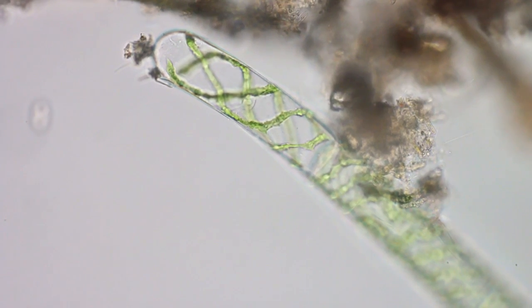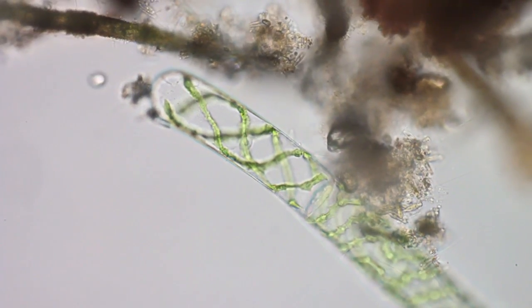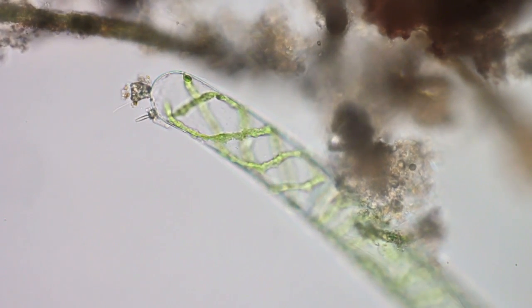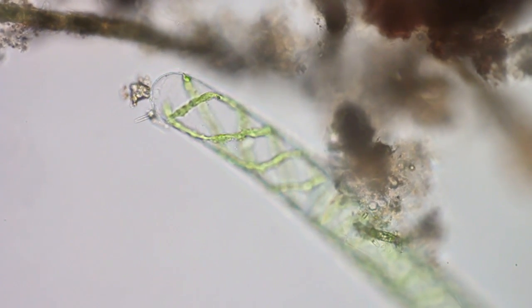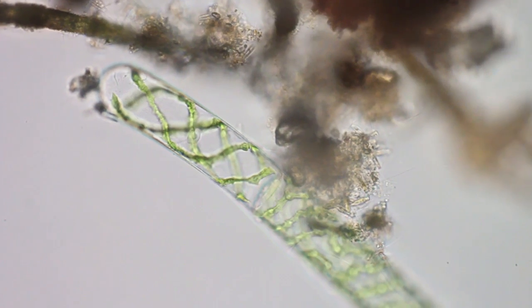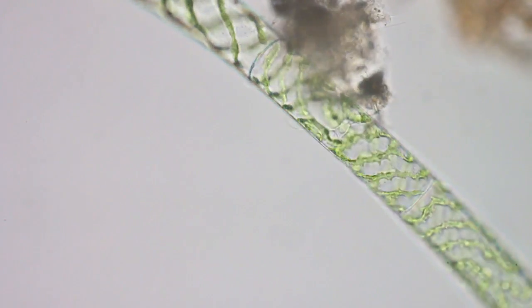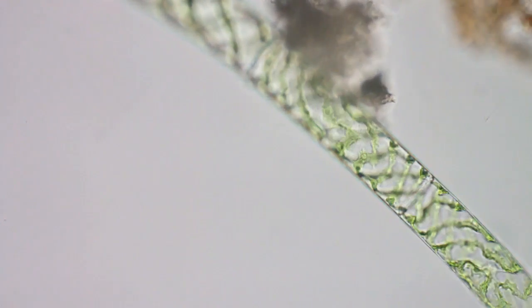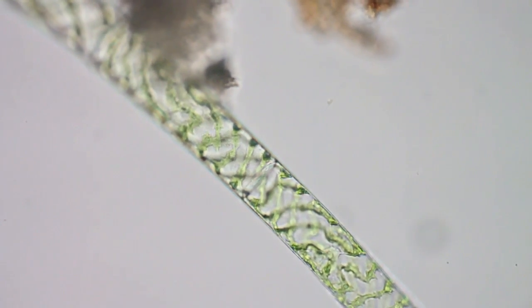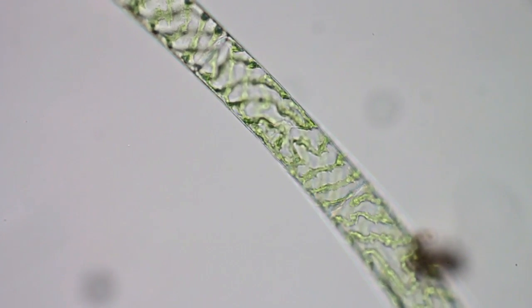This is 20x now, using a Nikon 20x plan apochromat - one of my better lenses. This algae is probably dead. It's been in the sample jar probably at least a couple of weeks. Kind of surprised it's still together - they usually fall apart pretty quickly.